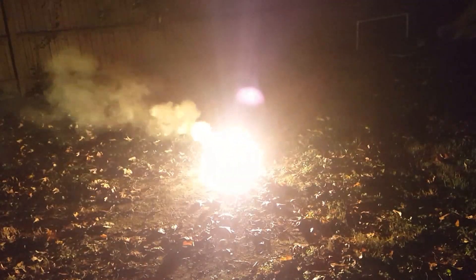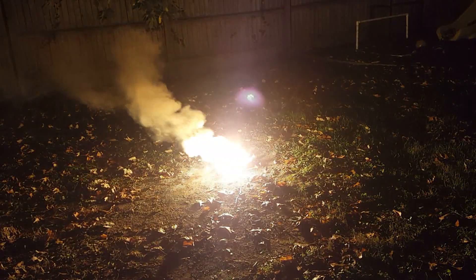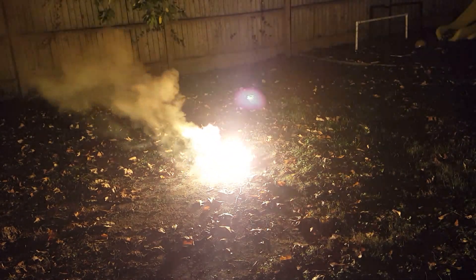There we go. As you can see, the reaction is really, really hot — several thousand degrees Fahrenheit. And we've got this molten bit of slag right here.